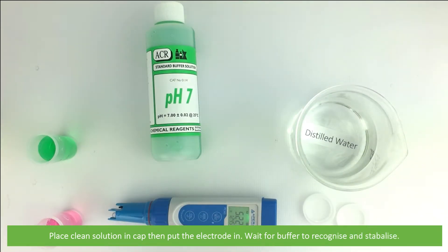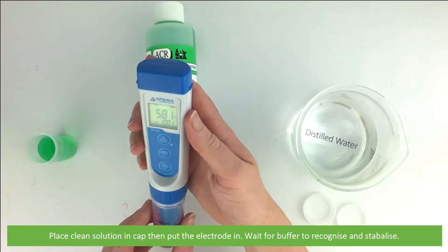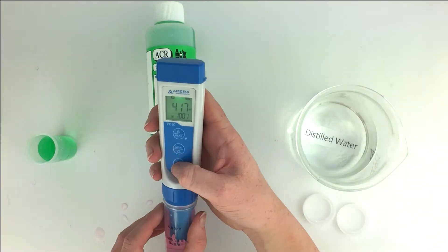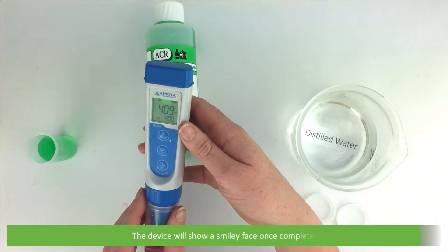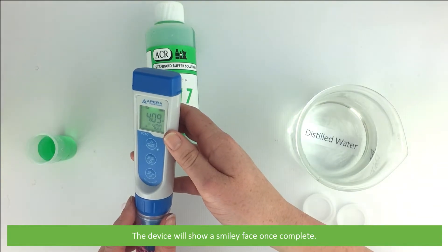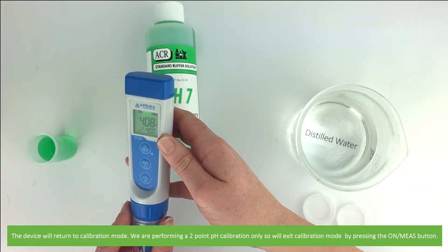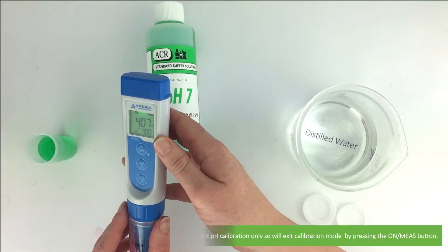Wait for the device to recognize the buffer and stabilize. The device will show a smiley face again once complete. From here the device will return to calibration mode. We are performing a two-point pH calibration only, so we will exit calibration mode by pressing the on/measure button.